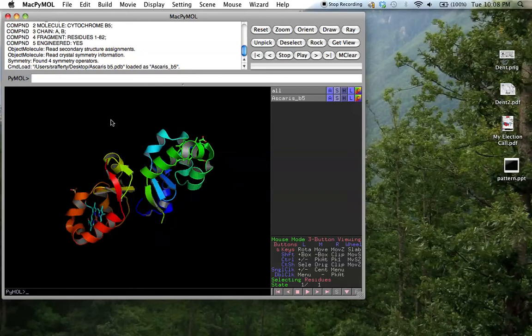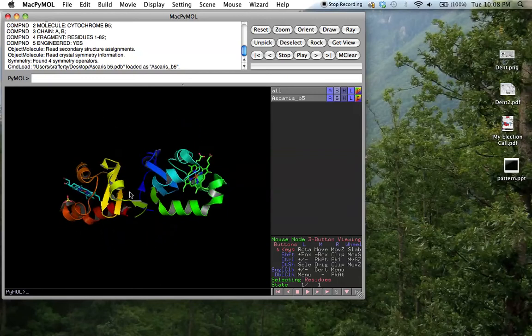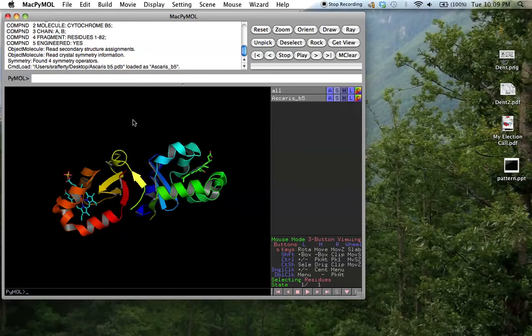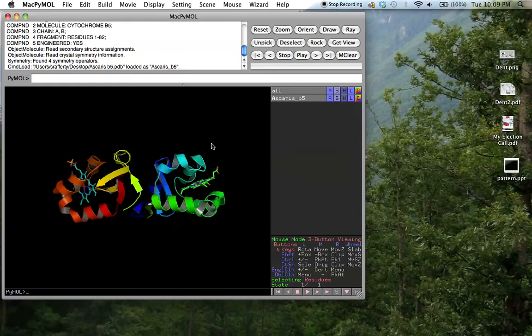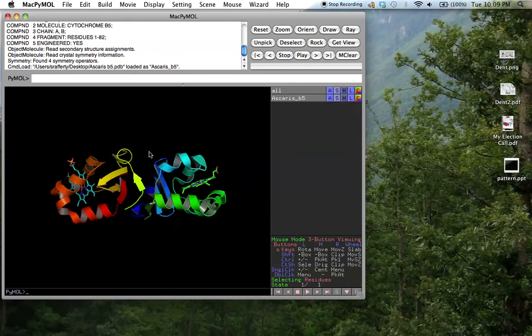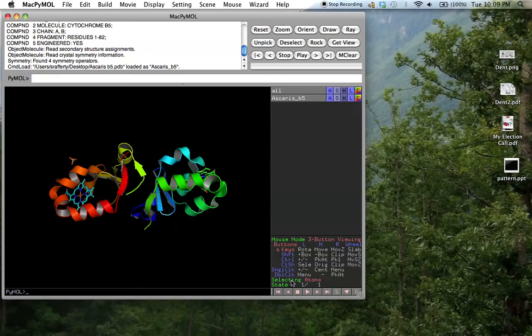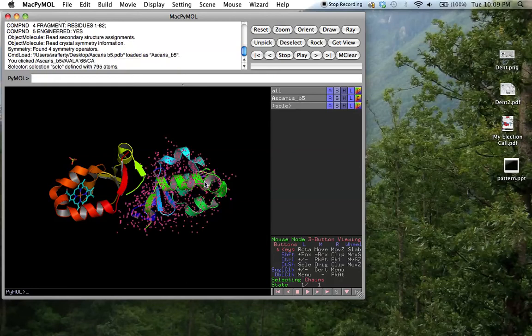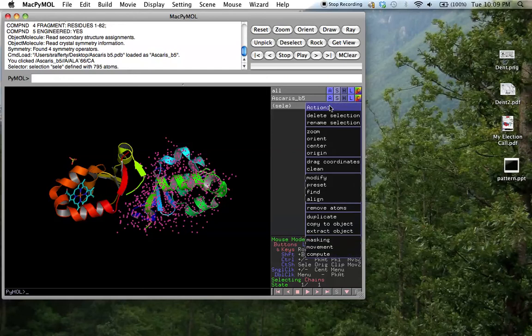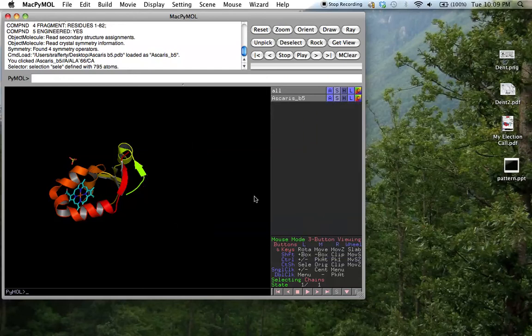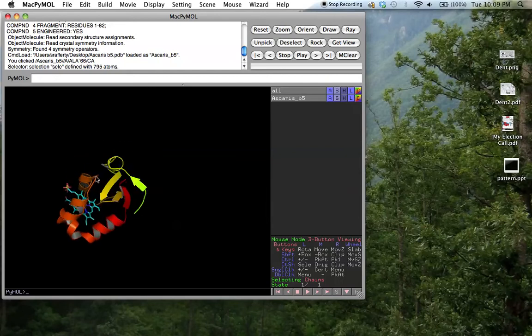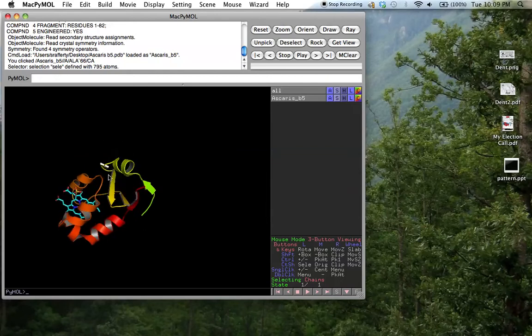Now you see we actually have two protein chains. For the purposes of the alignment, we only need one, and having two here just clutters them up. So what we can do is we can actually selectively remove one of them. We go down at the bottom right, change what we're selecting, and we change it to select chains. Click on one of the chains, select it, and then under the action button, just drag down to where it says remove atoms.